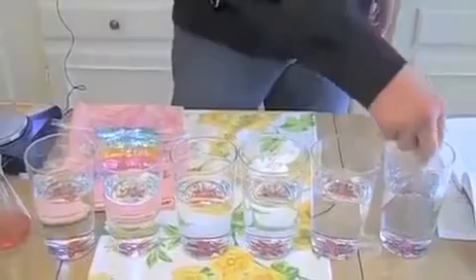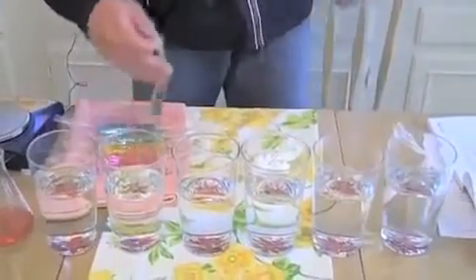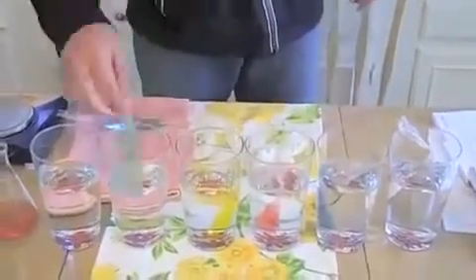Each bag is then placed into separate containers filled with distilled water. Then we wait 30 minutes for osmosis to occur.